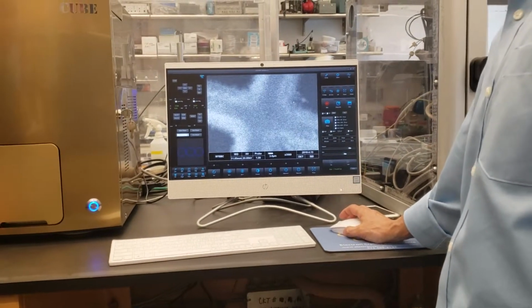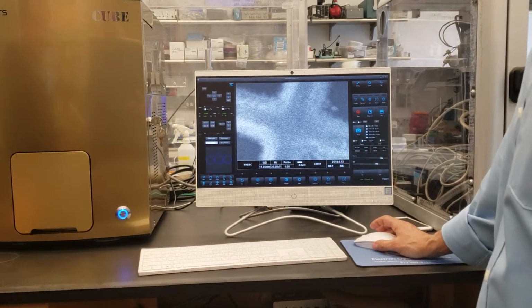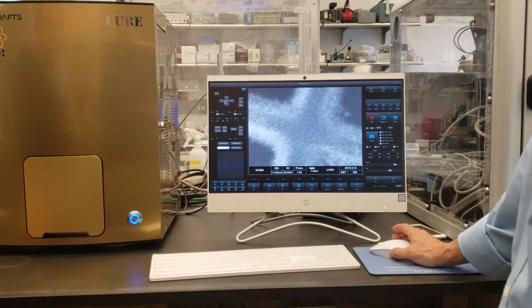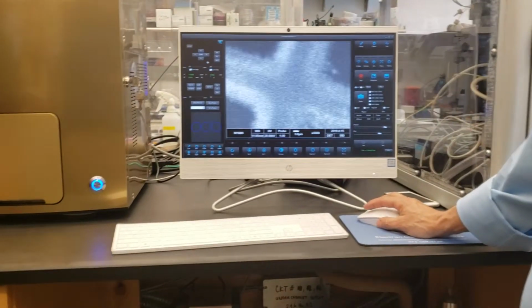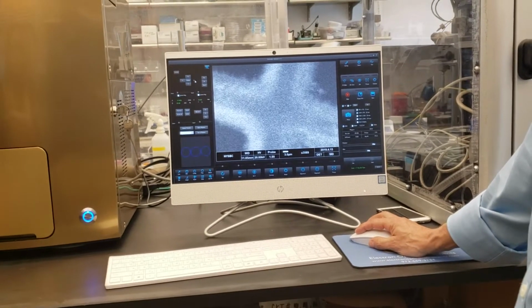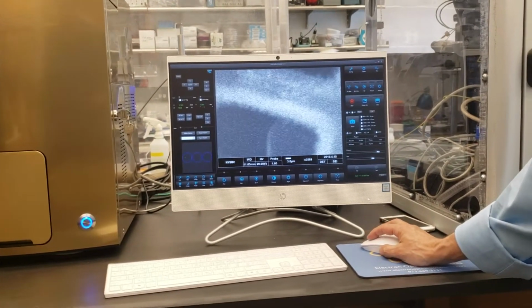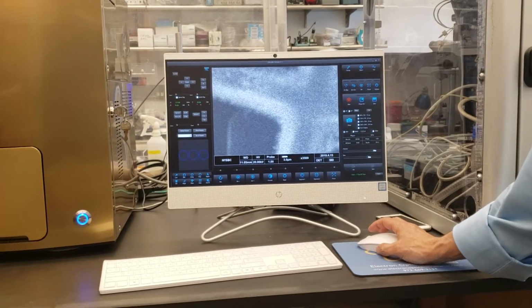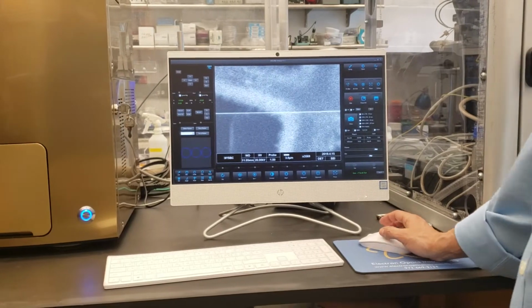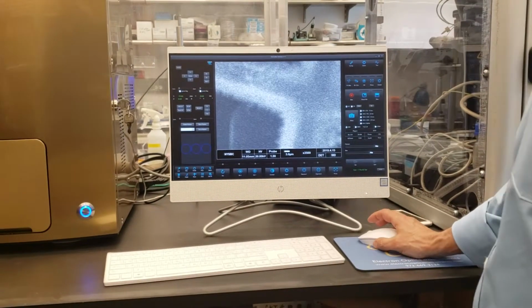to help you know what kind of image you're taking, you can do an annotation there. So right now, I'm going to skip a little bit, right? This is our stage program, and we don't need to home the stage or center the stage because we already are on our sample carousel where we need to be. But if I was to hit my X button, for instance, it'll move the stage in that direction, right? But I find that if I just double click my mouse, it centers everything up so much faster, and it's just a lot easier to use. What about the beam alignment? Do you need to do any of that at the beginning? So we'll hit that in a second.